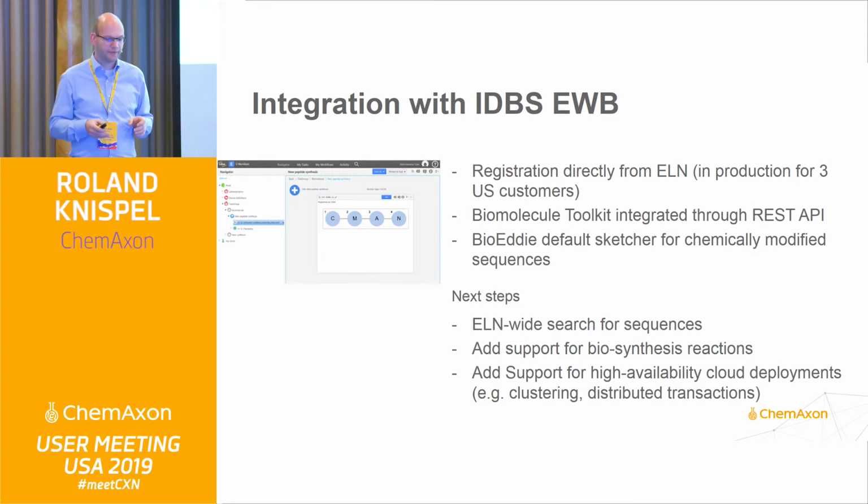We currently have 3 customers here in the United States that are using the IDBS eWorkbook in combination with our Biomolecule Toolkit and BioEddie for capturing of biological entities right away from the experiment description. BioEddie is essentially the default sketcher for chemically modified sequences, and it's also connected to the toolkit for registering these kinds of entities in a central repository.